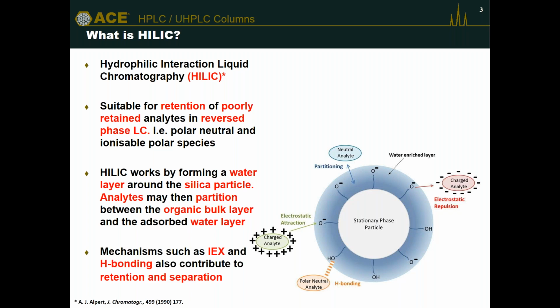There are other mechanisms of interaction also at play with HILIC. There are modes of interaction such as ion exchange, hydrogen bonding, attraction and repulsion type mechanisms too. So this is quite a complex chromatography separation mode.